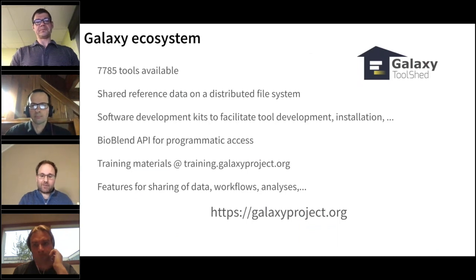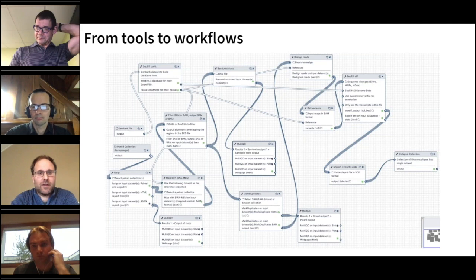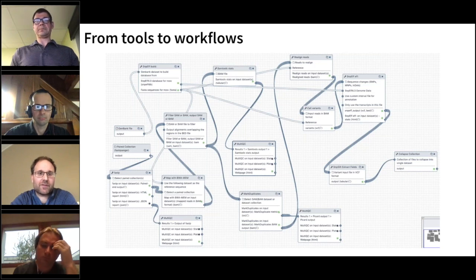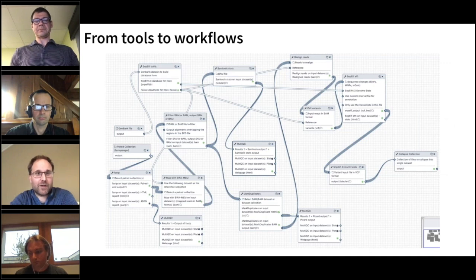And one important aspect that I want to highlight, I don't have the time to go into all the details and features of Galaxy, is the fact that you can string tools together into workflows to make sure that you can reproduce your analysis easily with all the correct parameters, tool versions, etc. And you can share this with colleagues across the world in an easy way. And we can do this for these asynchronous workflows that you just run and wait until the result is there.